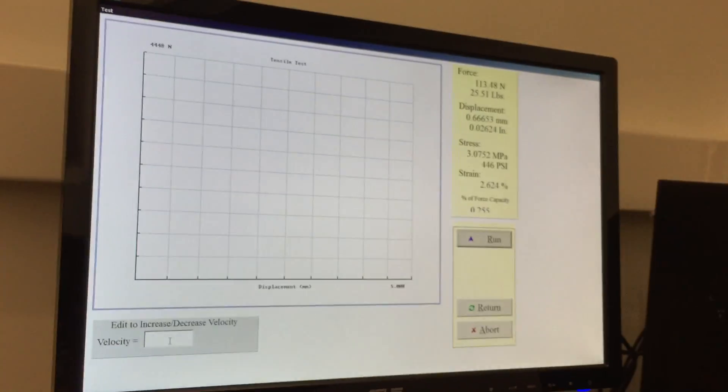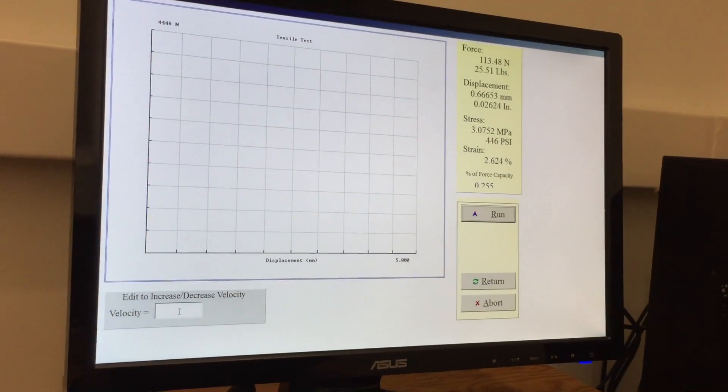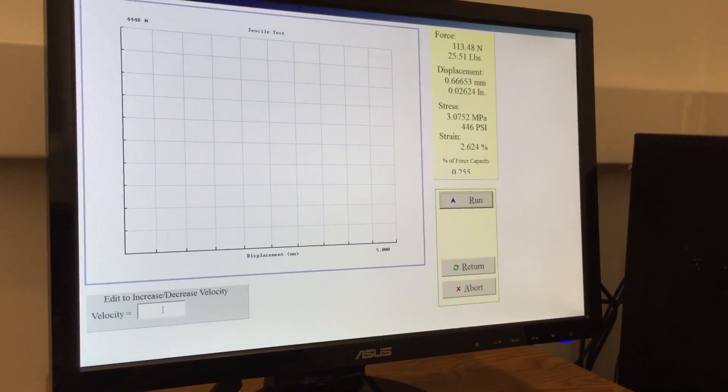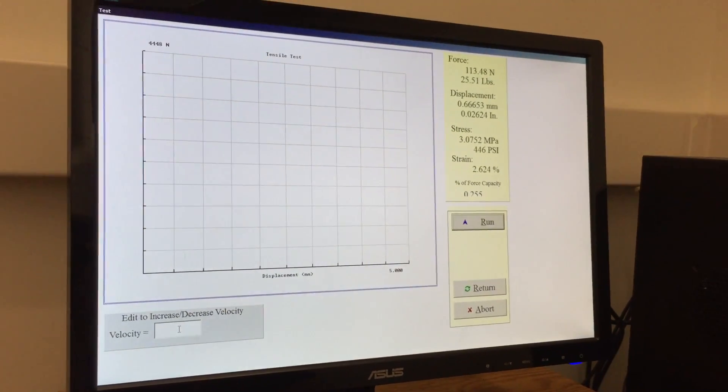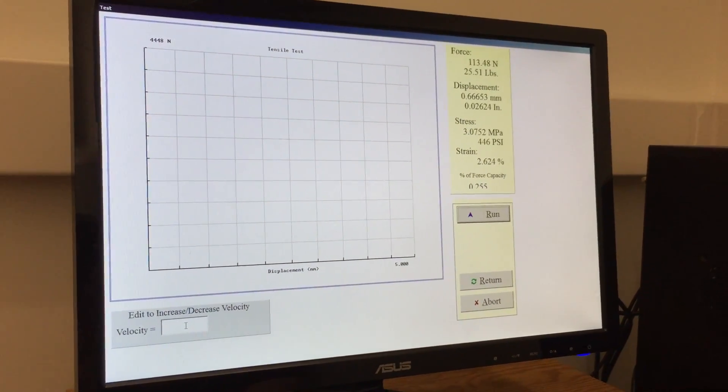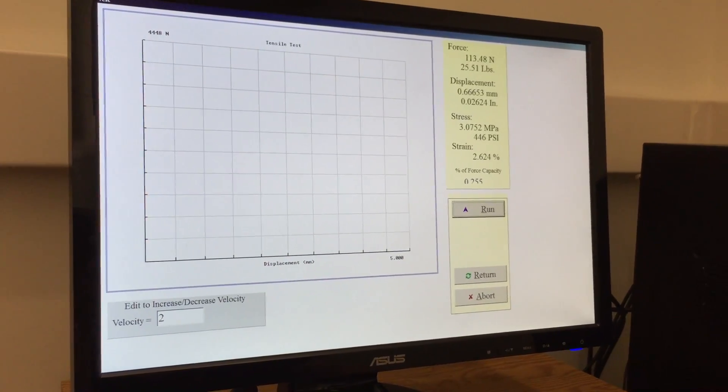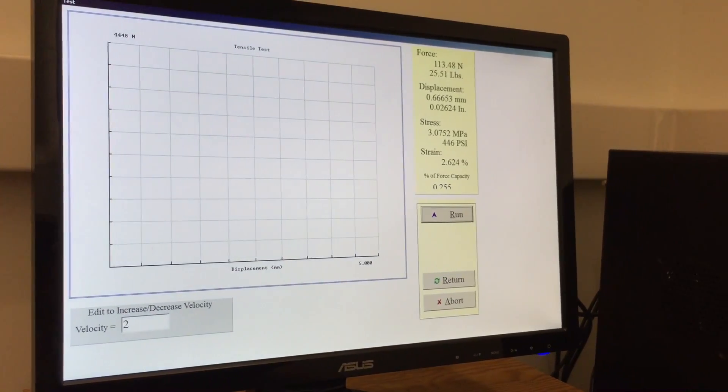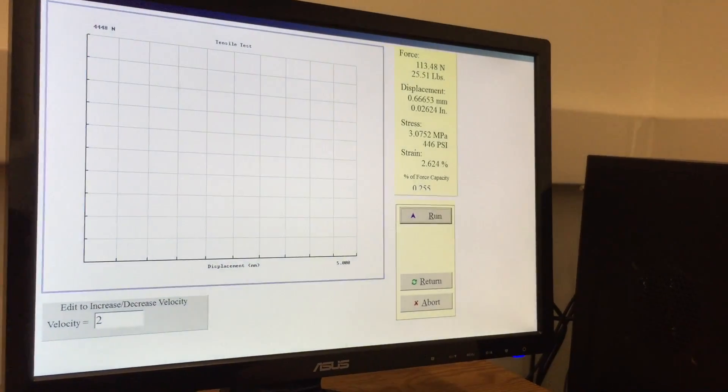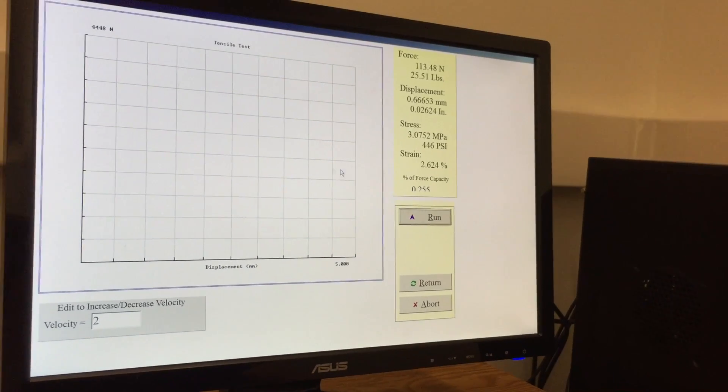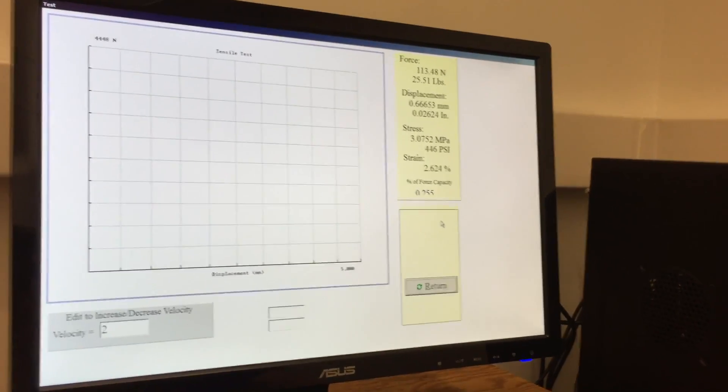If you're happy with the setup, the last thing to do is check the speed that it actually tries to displace the specimen at. We found that about two millimeters per minute was sufficient because the material's brittle. If you're happy with everything, hit run.